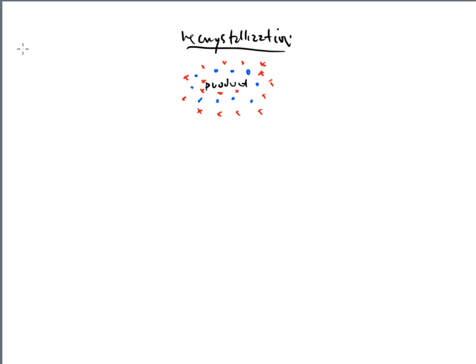Let's list those over here to the side. Byproducts, which are products that are made that we don't want. Number two, you could have remnants of solvents that are left behind. Number three, you could have remnants of reagents that are left behind. There's a whole number of different things that go on in this process when I make a product. And we have to get rid of all of those impurities. And that's what we're calling an impurity.